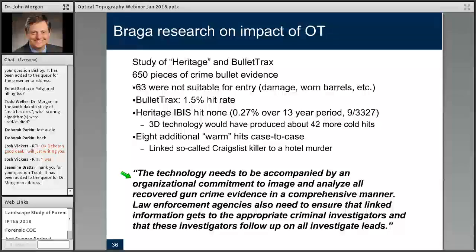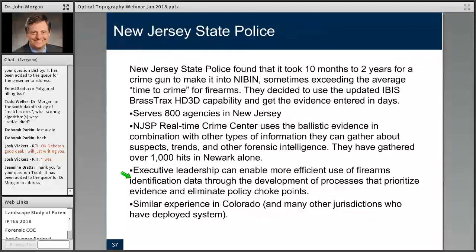If you are not a firearms examiner or in the crime laboratory, if you're in a police department, whose job is to investigate crime, or you're a police chief, please, if there's nothing else you take away from this presentation, please take that away. This technology allows the firearms examiner to do an awful lot more for you, and actually solve cases. This is an extraordinarily important takeaway for those who are outside of the forensic science community but customers of it.